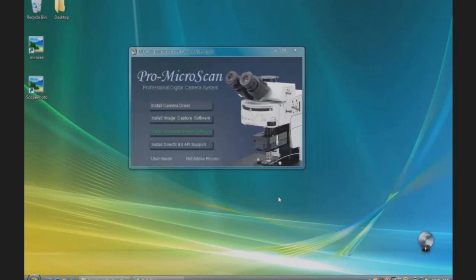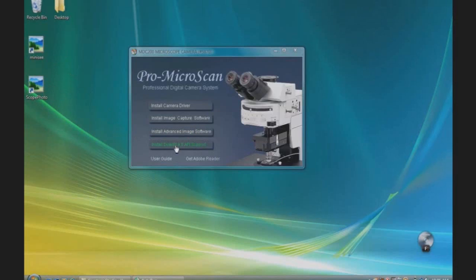You will now see the Scope Photo and Mini-C icon on the desktop. Next, install the DirectX 9.0 API support tool.